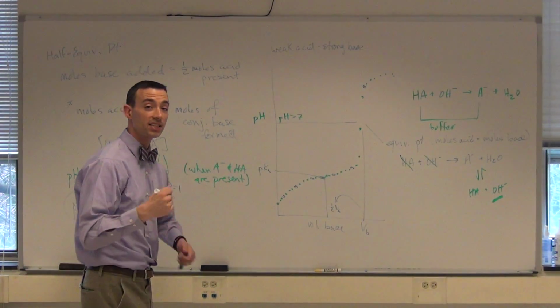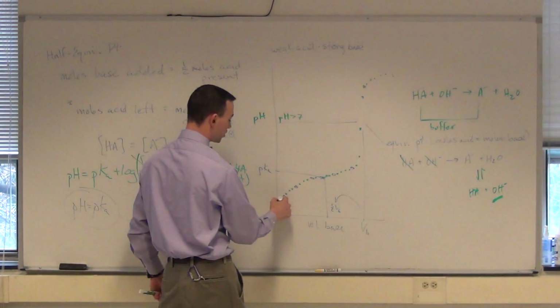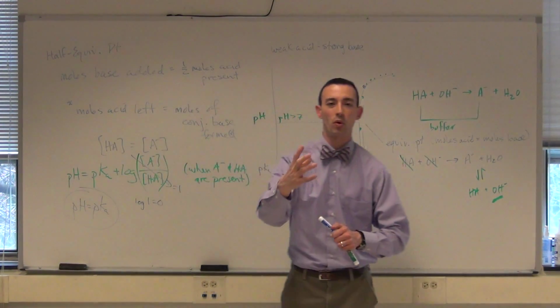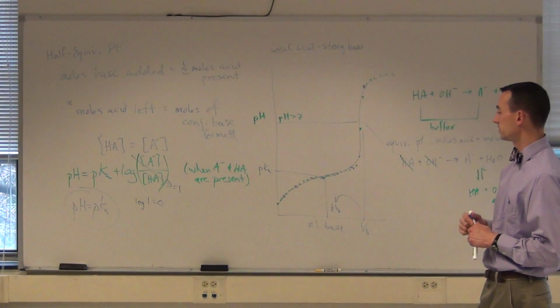When you make this graph in Excel, you may use the connect the dot feature and have it add this line. This is not a trend line. This is the simple connecting of the dots with a smooth curve. Okay?